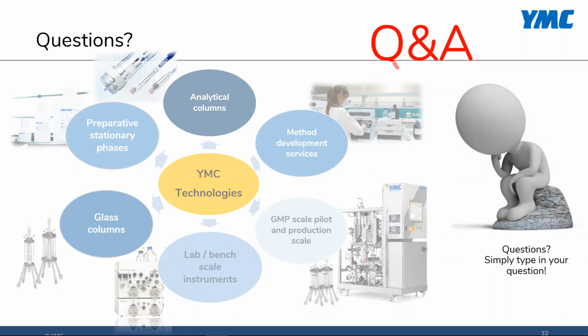Whereas with the DAD, the piston's already coming in the downward direction, so really all you have to do is pop the end piece off, slide that bucket or beaker underneath there, and just use the piston to push that whole column right down out of the bottom, and it just falls right into your bucket. So that makes life a lot easier. But like I said during the presentation, you do have to take into account the ceiling heights, because the DAD tends to be a little bit taller, I think it's like a foot and a half taller than the DAU system.